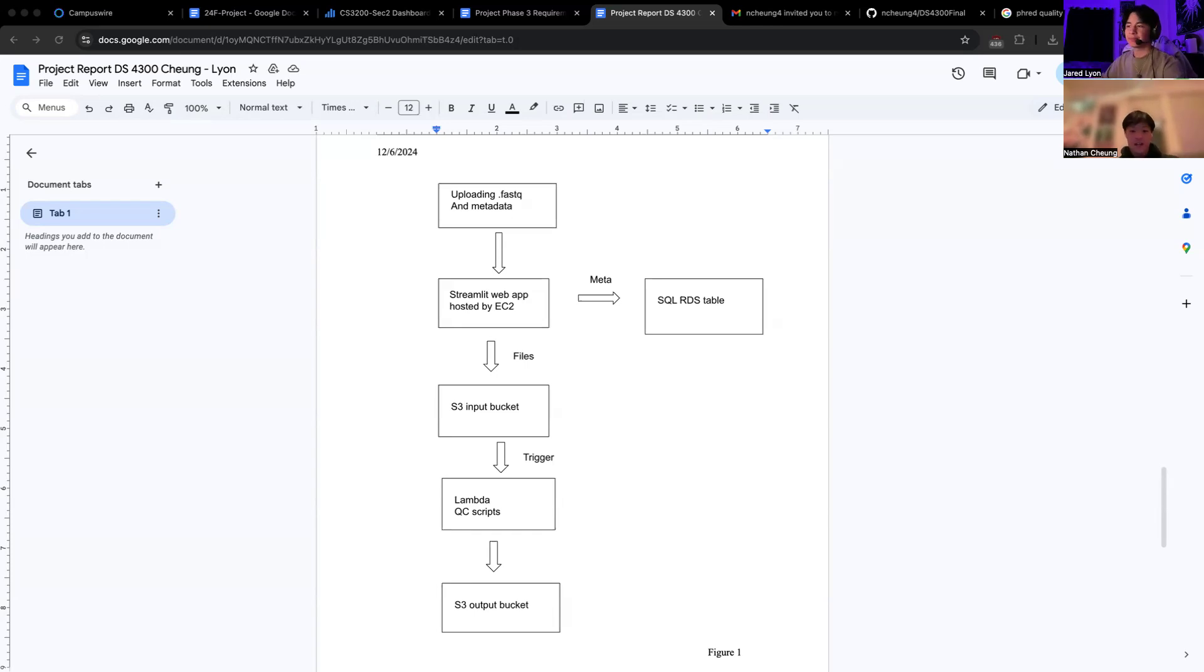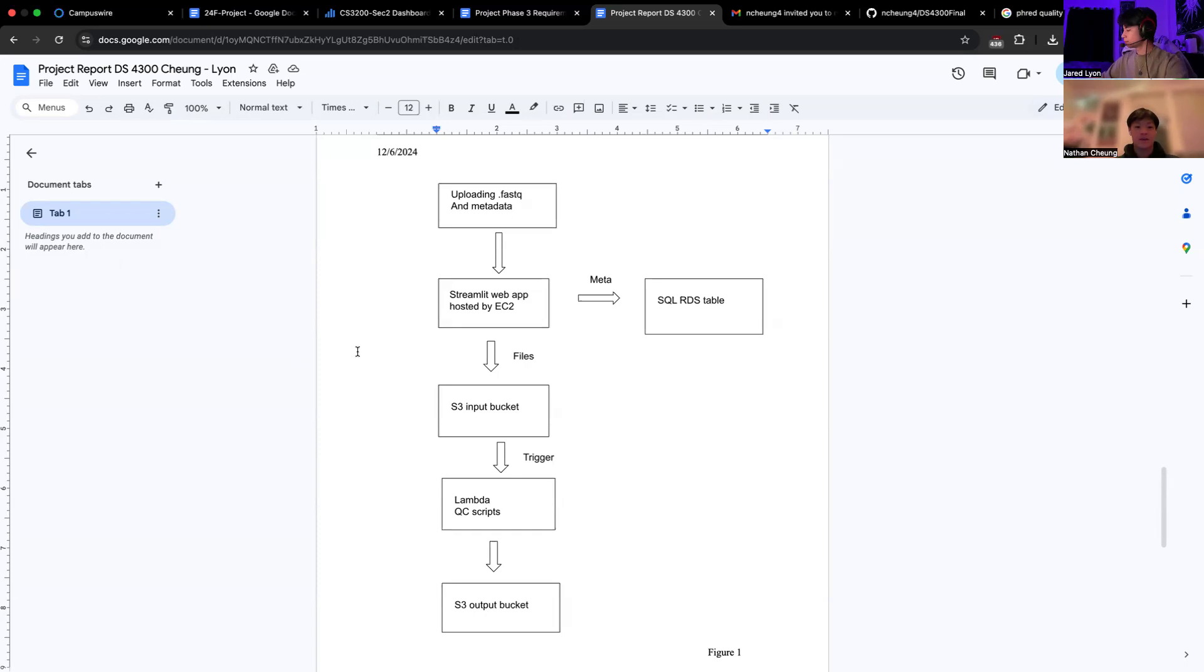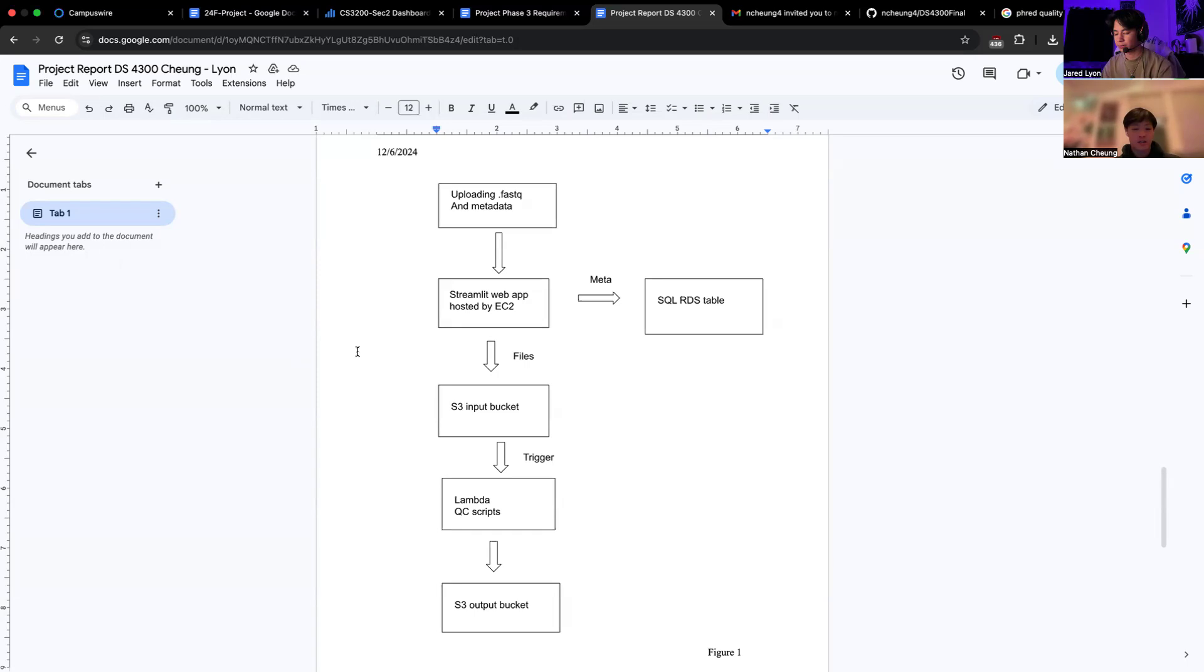Our project focuses on designing and implementing a data pipeline to process genomic sequencing data stored in FASTQ files. These files are widely used in bioinformatics and contain biological sequence data along with corresponding quality scores, making them essential for next-generation sequencing, or NGS, workflows.